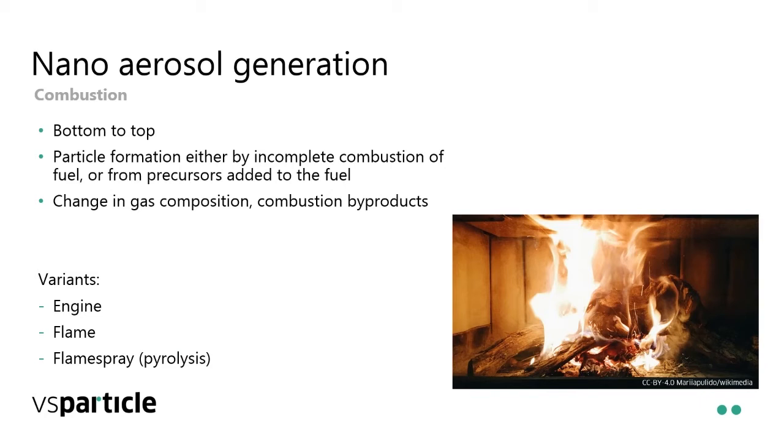What's challenging with these is that your gas composition changes, right? So you start with something that contains carbon dioxide, some water's in there, there's typically some nitrogen still in there. You might not have combusted all your fuel. So without even looking at the particles, already a pretty complex system. And then you have to deal with what the particles did. But having said that, it is a very common method of making particles, right?